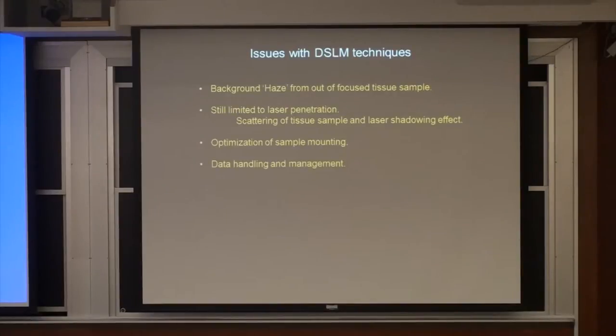So your whole machining and geometry is very important. And the second thing, which I think is a big issue, is that in this kind of case, once I am taking these kinds of images, it becomes a really large image. These are easily one overnight experiment, 600, 700 gig of data. So you have to do a lot of data handling, image processing, and segmentation, and kind of automation in terms of getting some quantitative information out.